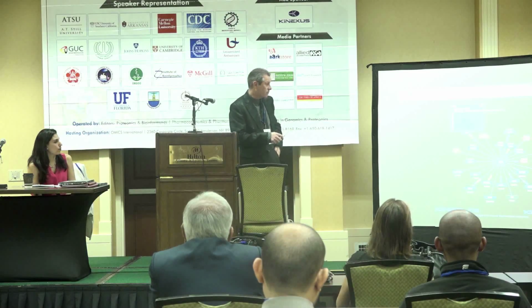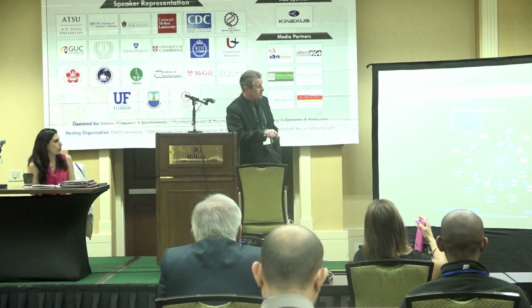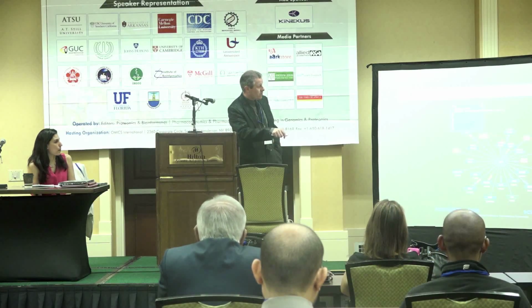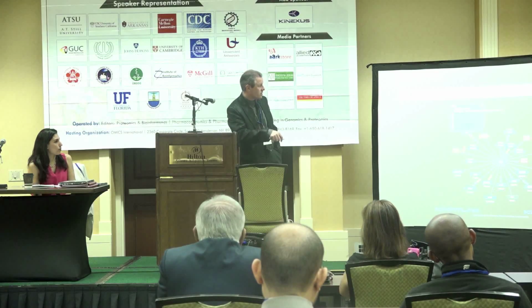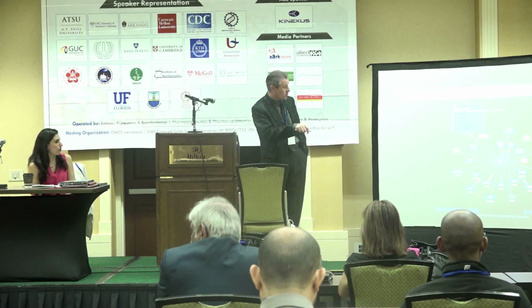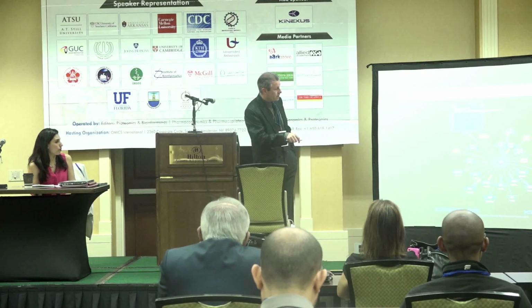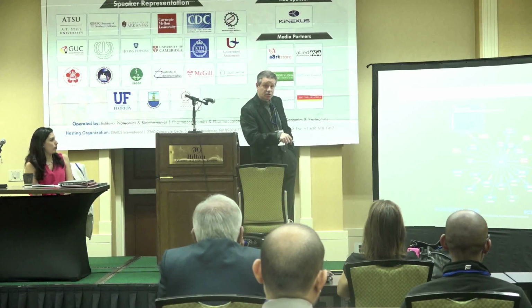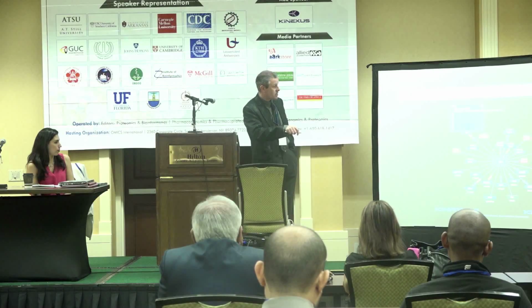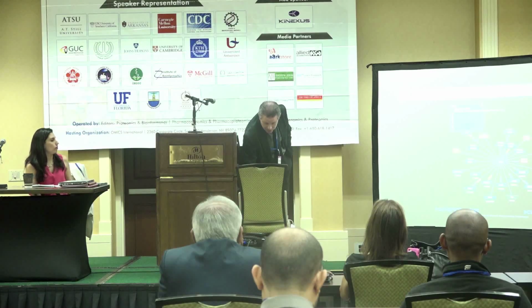We have this also for protein-protein interactions with detailed links. Here's your target protein, the insulin receptor, and this is a real image from the analysis, with the proteins being color-coded, and you'll get links to different pathways, different protein-protein interactions. The more it's been reported in the literature, the closer those interactions are on the map. Also, you can customize this to different types of tissues. If you pick a particular model system, it takes transcriptome data, and the size of the icon is a reflection of the level of that protein in that tissue type. So you get different maps for different tissues.